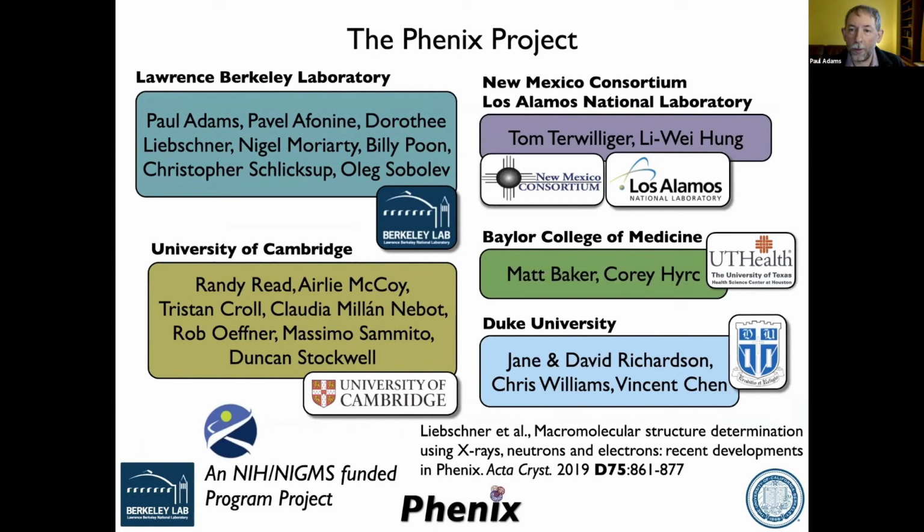Sure, but I would also say that, and I'm sure Jane would say this, we should also go and check if there are clashes that show up as problems. Go and look at them. We always go and look at the model. There is no alternative to looking at the model. We can't automate all of this for you.